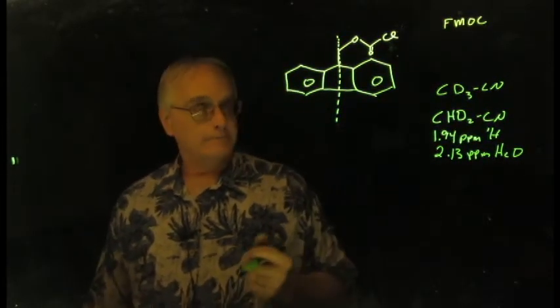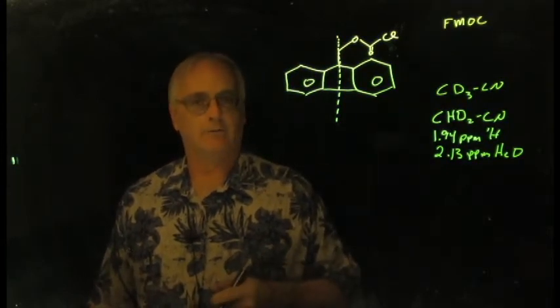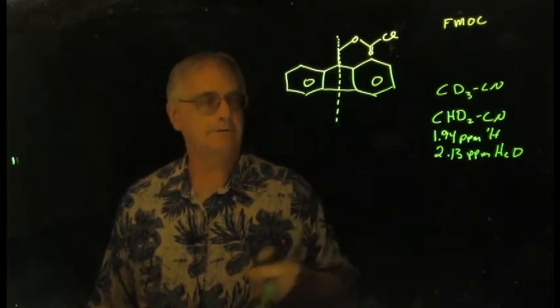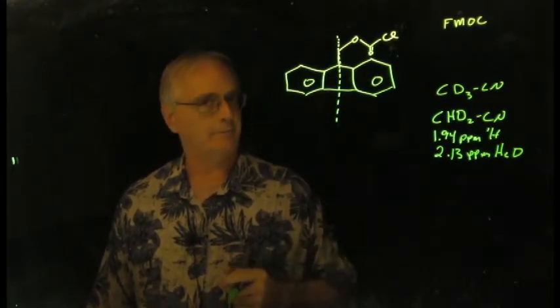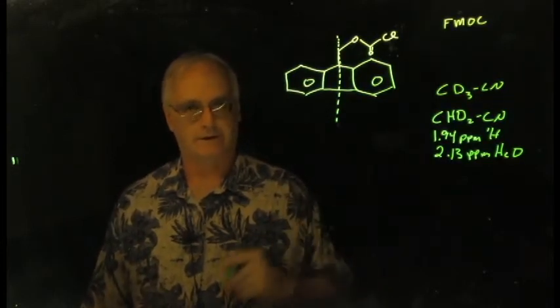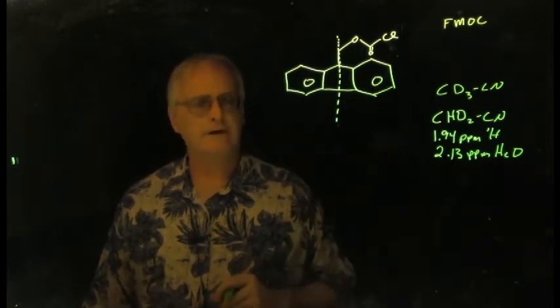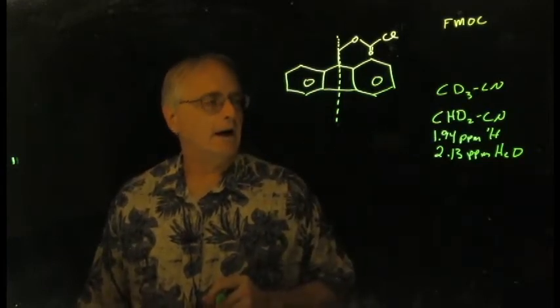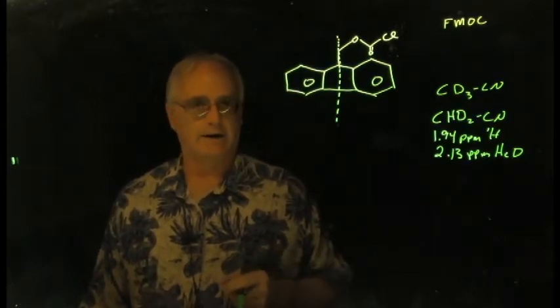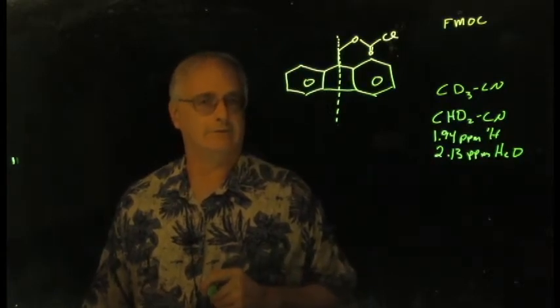Now, water could be that a polar solvent has absorbed a little bit of water from the atmosphere. If it was used in the open atmosphere, all solvents are going to pick up a trace of water. Only if it's been in a dry box under anhydrous conditions can you avoid this sort of thing. Some samples, if they're polar molecules or hygroscopic, will pick up water out of the atmosphere. So water comes in almost every single proton NMR spectrum you run.